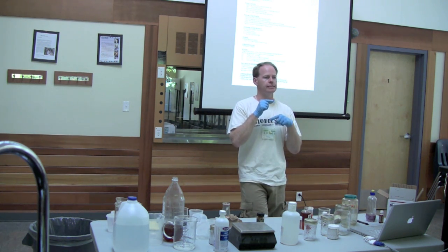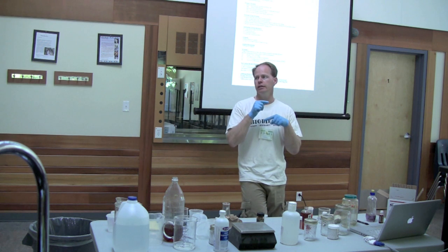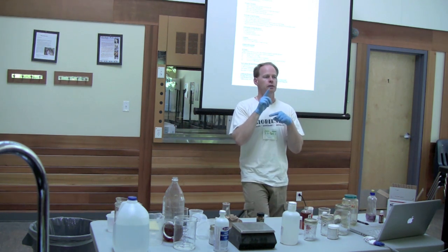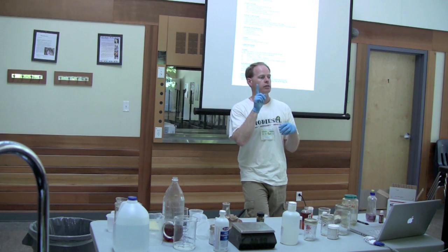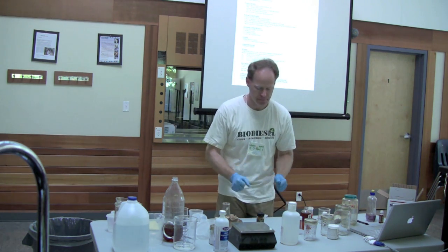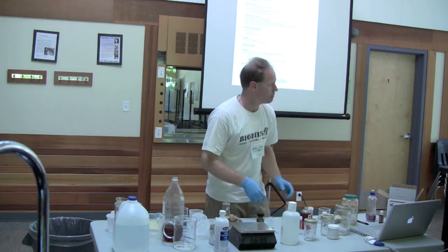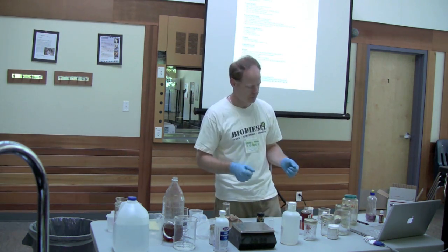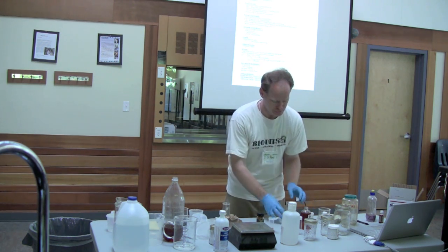That's the tool that the ASTM standard on the commercial scale uses to test fuel to see if it's within specification, just for the how well did we react the oil into biodiesel standard. It's the total and free glycerin standard, okay? So with that in mind, we're probably a little hotter in here than that, but we're good enough for what we need to do for this test.